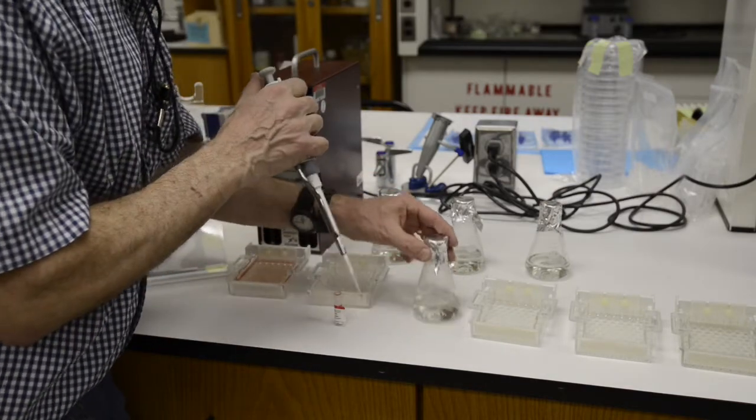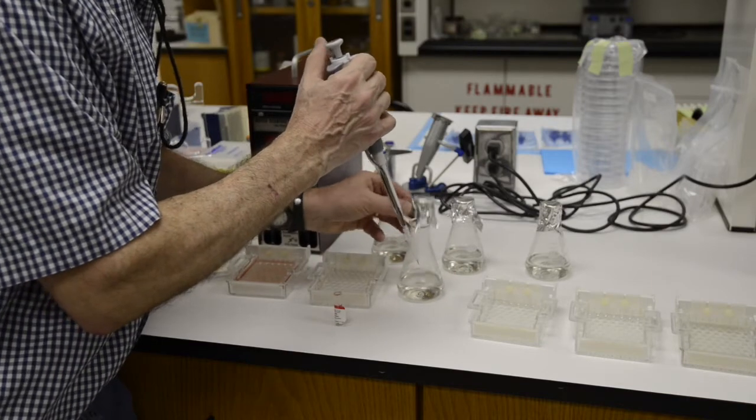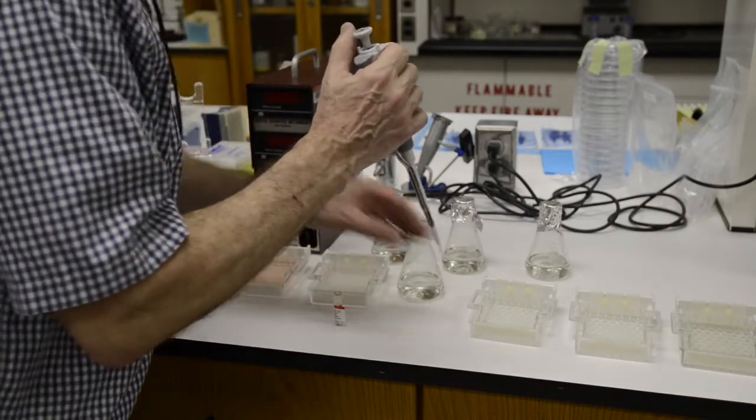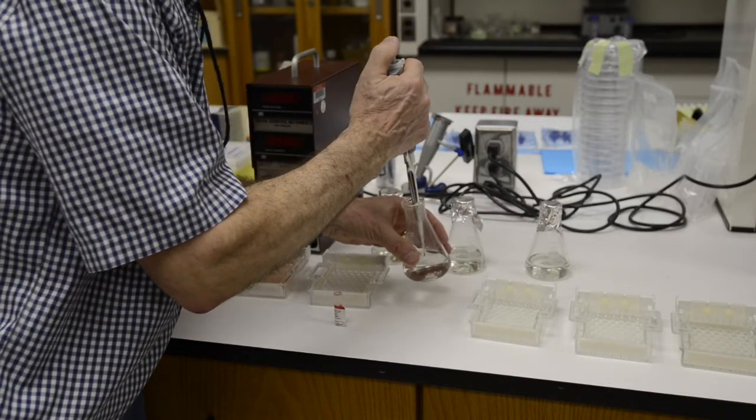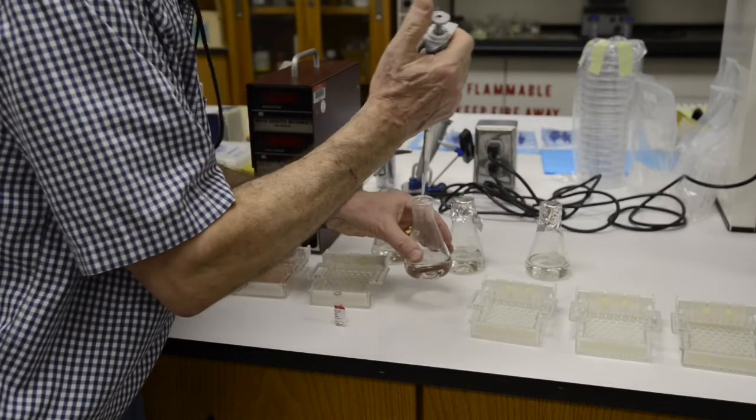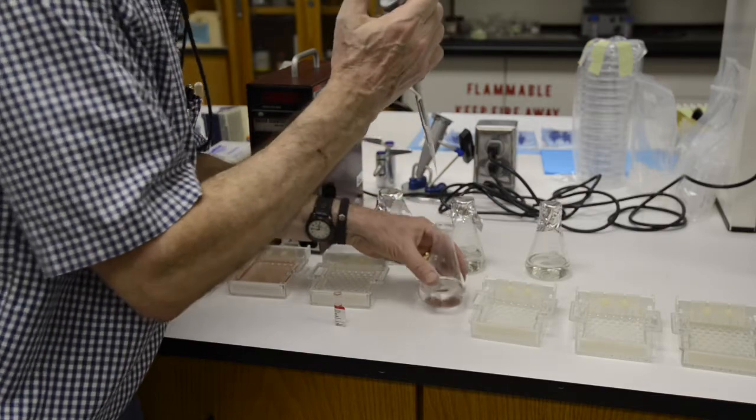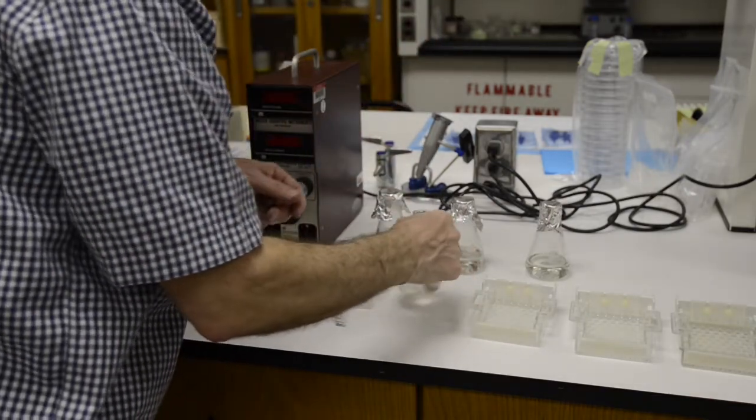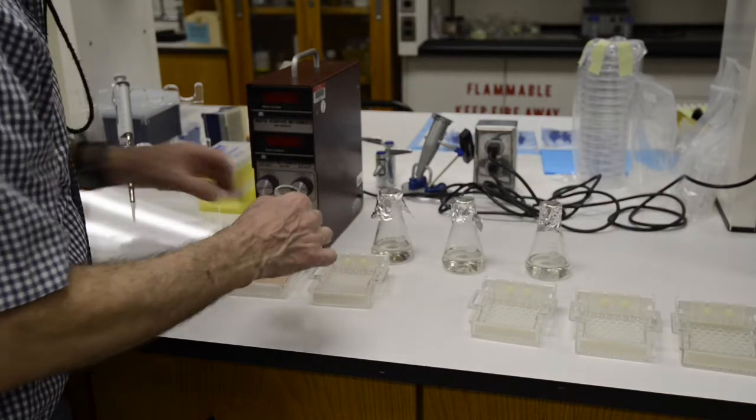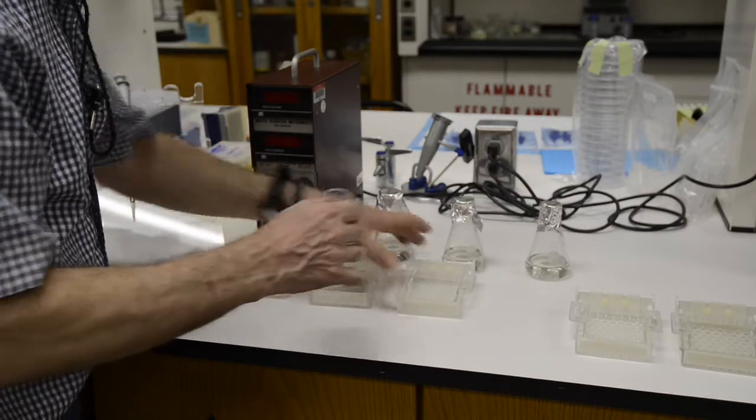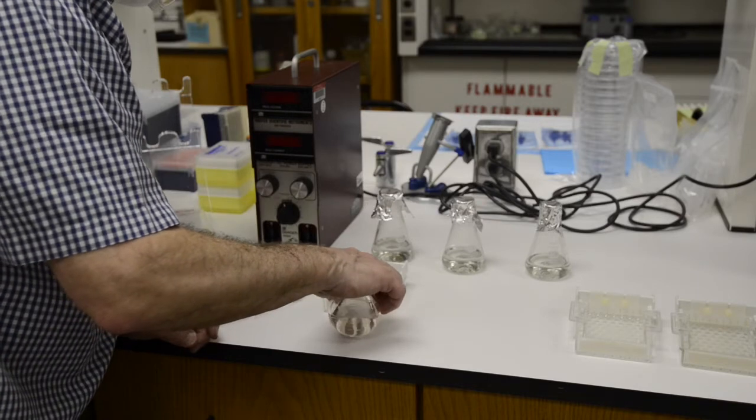So once more, the amount of gel red you're going to put into the 1% agarose is 5 microliters, 5.0 microliters. When you do that, the gel is not going to appear red. It will look pretty much clear. But under a fluorescent light, DNA will fluoresce red in the presence of that dye.